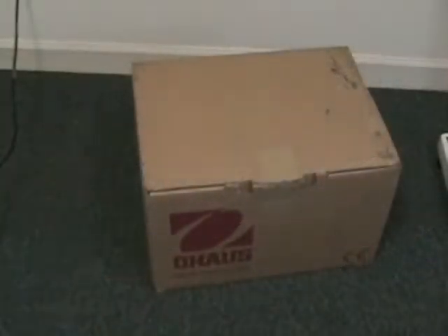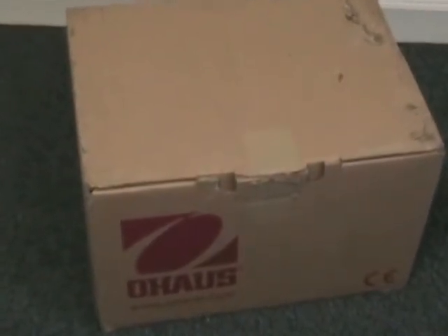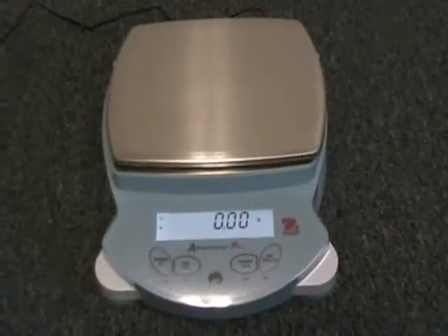The Adventurer Pro family offers capacities ranging from 51 grams to 8100 grams, available with your choice of internal or external calibration.